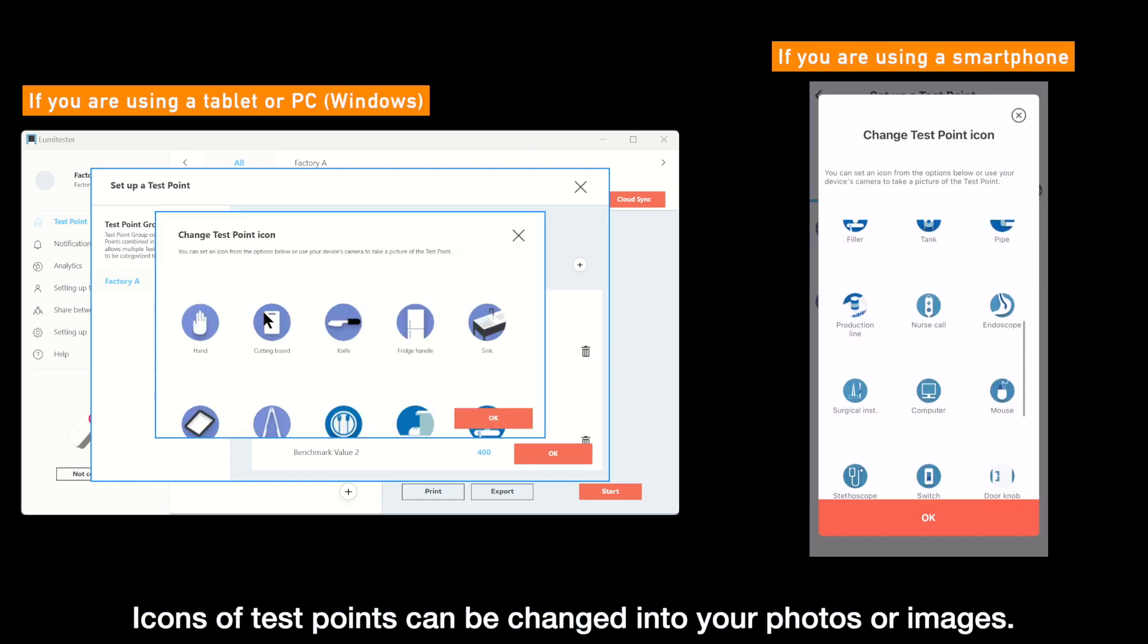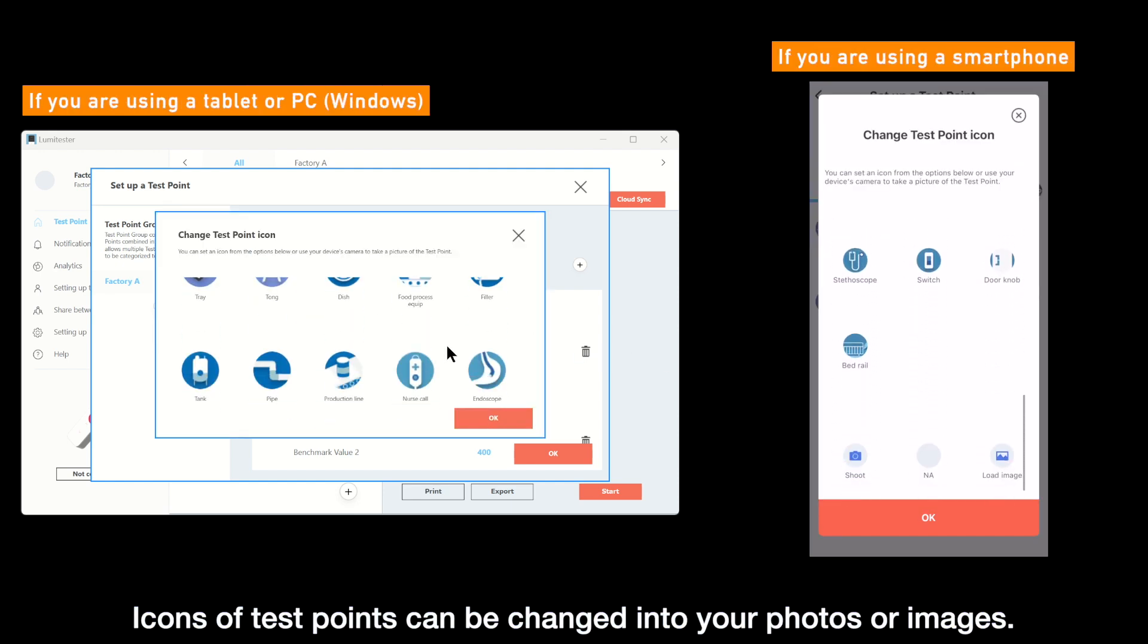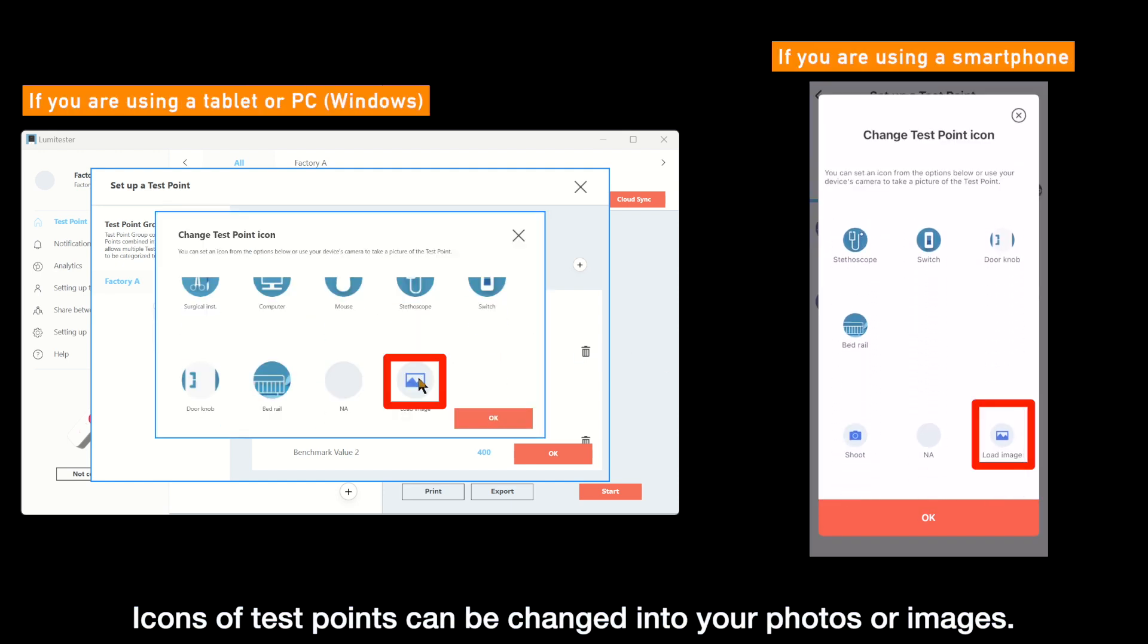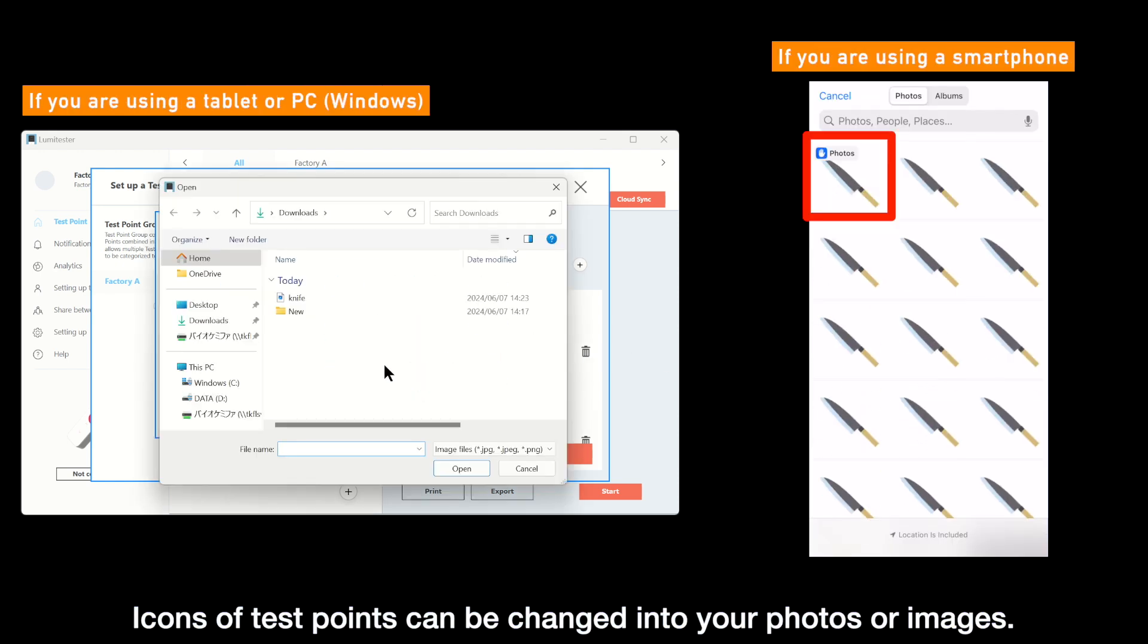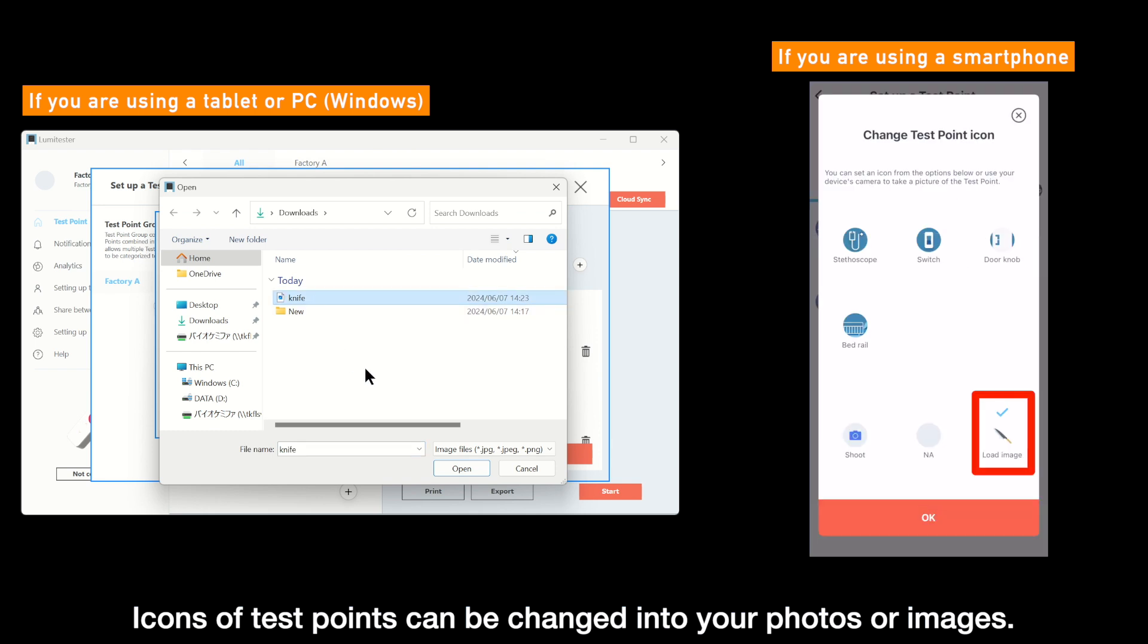Incidentally, icons of test points can be changed into any photo or image you like.